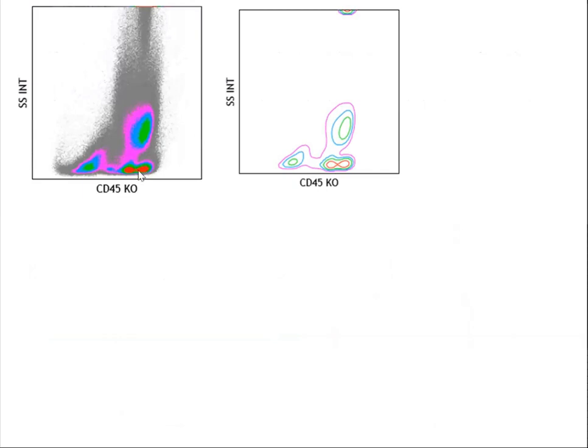The majority of the lymphocytes are here. Of course, there are some hematogones, but the lymphocytes are here and the erythroids are here. Now, if I want to get only the lymphocyte population, I can easily draw a region like this. See how beautifully it is demarcated. In fact, the stage 1 hematogones is so clear. So I can clearly draw a region around the lymphocytes.